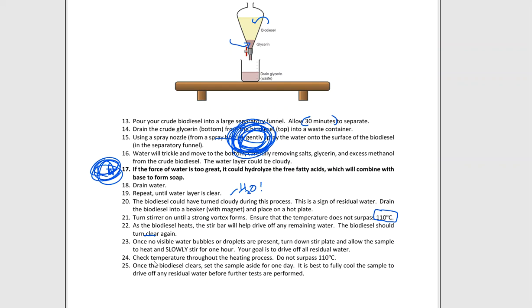Number 24, check your temperature. Make sure you don't go over 110. And 25, once the biodiesel clears, set the sample aside for 1 day. And it's best to fully cool the sample to drive off any water before you go through with any other test.